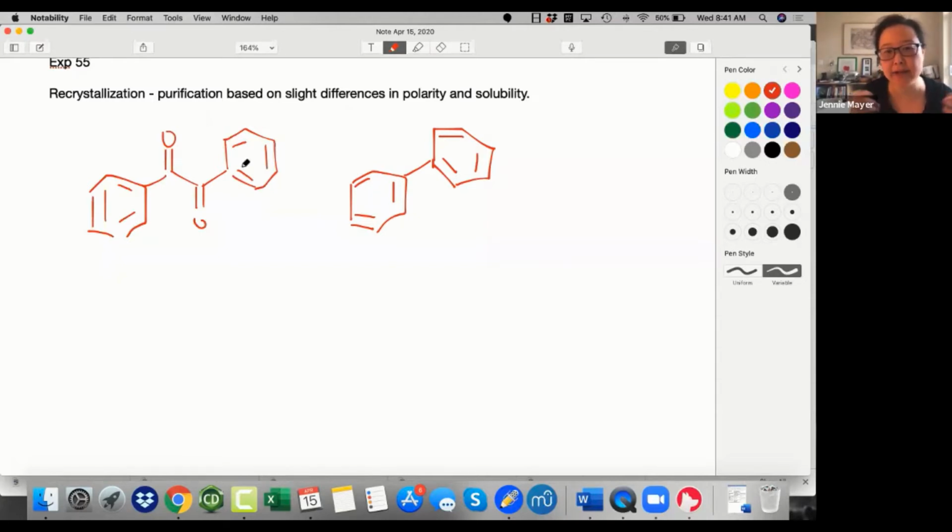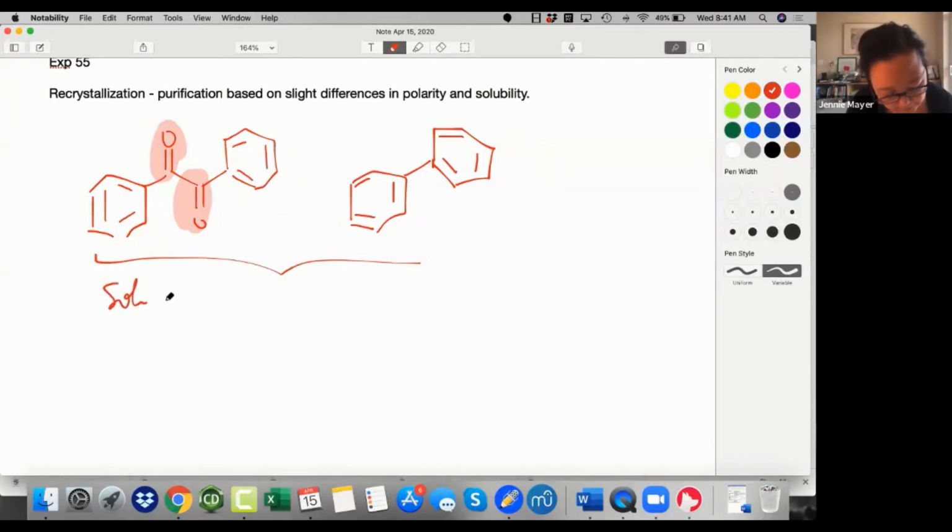But being soluble in hexane, they're going to be too soluble in hexane. So if I'm trying to separate them, I want to take advantage of the fact that this one has this additional polarity from the C double bond O carbonyl groups. So I would probably want to choose a solvent that's intermediately polar to take advantage of something that's polar there.